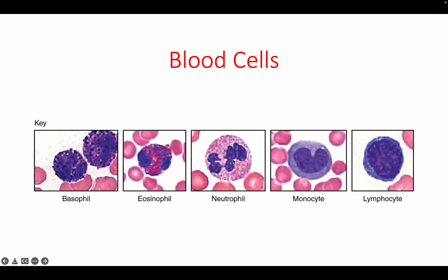And then in neutrophil, we're going to see multilobular nuclei. What I mean by that is three or more. So there's two here in the eosinophil. The neutrophil looks like there's multiple lobes, right? Three or four or five, maybe even six lobes here. That's how we know we're looking at a neutrophil. So this lightish pinkish background stain, lots of lobes, a bunch of nuclear balls sitting in here: neutrophil.